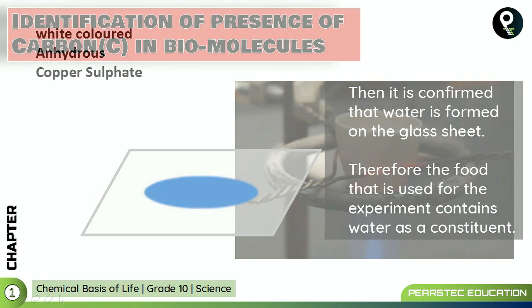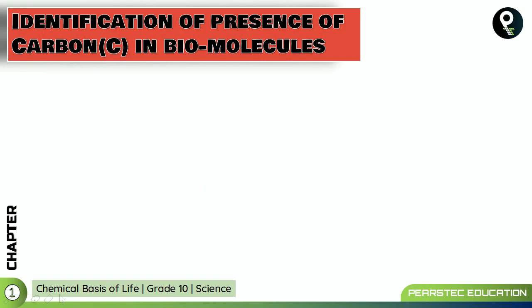Now let's do another test, for carbon. Identification of the presence of carbon in biomolecules.